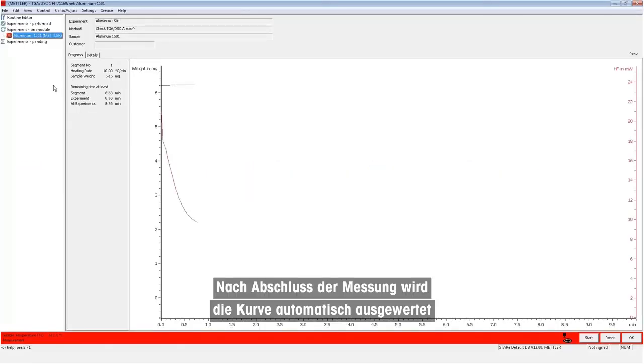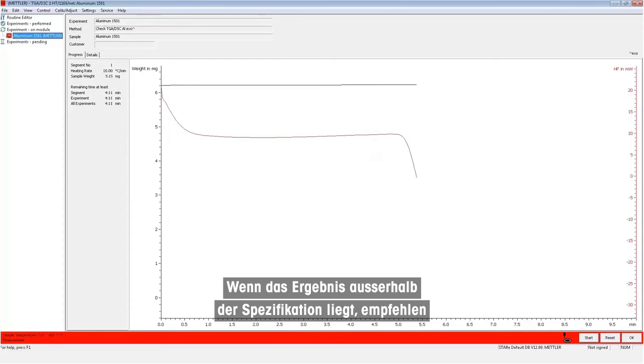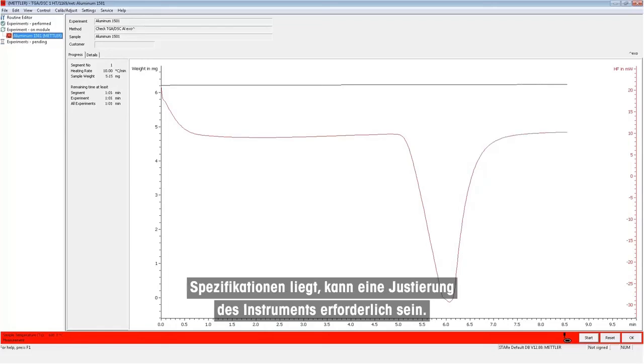When the measurement is complete, the curve will be automatically evaluated and the result will be displayed inside the module control window. If the result is out of specification, we would recommend running a second measurement using the same sample. If it is still out of specifications following the second measurement, then it may be necessary to adjust the instrument.